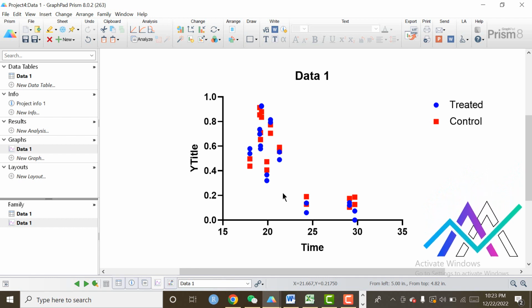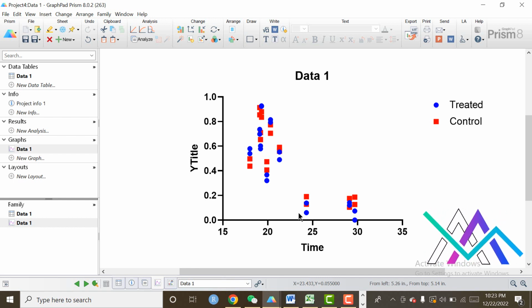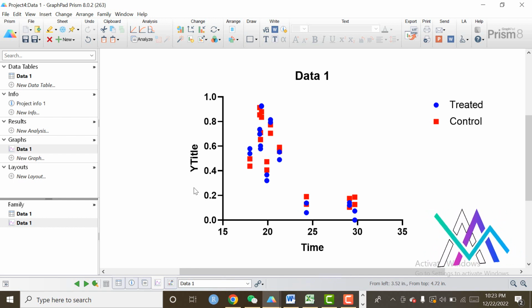Why is a scatter plot useful? Why are we making an XY graph? This is often the best way to display our variation as it shows your data exactly. Within Prism there are three ways we can create an XY plot. If you want to plot two or more datasets of continuous data, then it's best to select an XY scatter plot. Each X value can give you several replicates for every dataset, and when you make your graph, you can choose to show all the replicates on your graph instead of error bars. Start with an XY table.